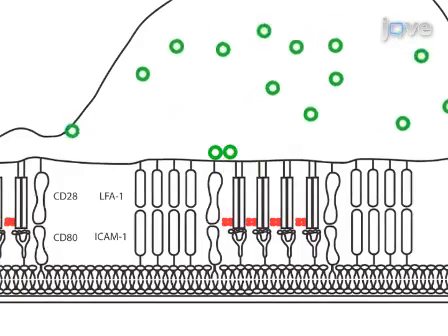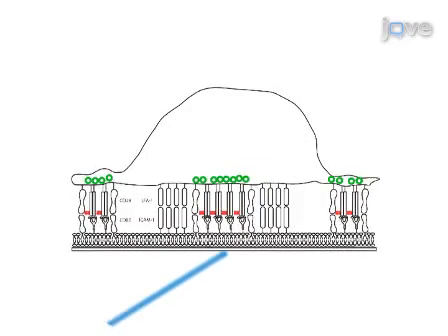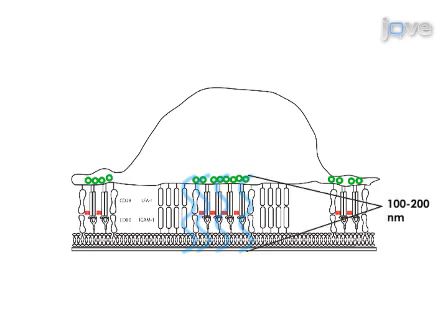The T-cell receptor is then fluorescently labeled, and imaging is performed, in which the cells are immersed in medium with lower refractive index than the cover glass and illuminated by a laser beam at an angle that undergoes total internal reflection. This generates an evanescent wave at the glass-water interface, which decays exponentially into the medium, allowing a penetration depth of 100 to 200 nanometers. Thus, only fluorophores in the plasma membrane, or very close to it, are excited.